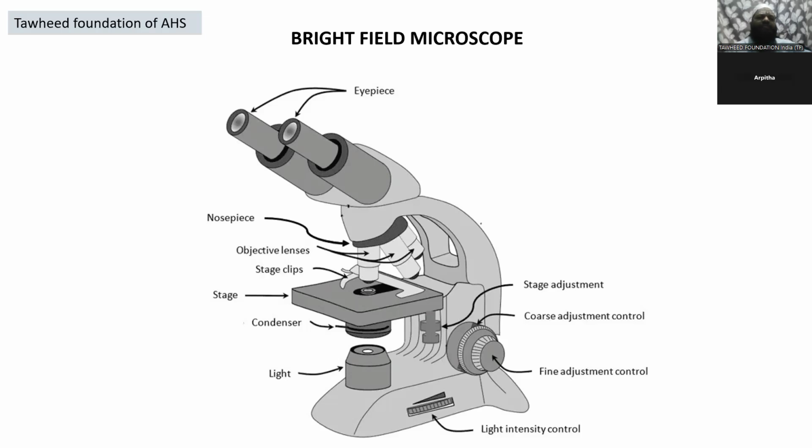The ocular lens is also known as the eyepiece. The image of microscopic objects can be viewed through these lenses. There are four types of magnification in the ocular lens: 5x, 10x, 15x, and 20x. Here, the objective lenses will be 10x, 40x, and oil immersion, that is 100x. The binocular head is the device that uses two eyepieces and has many mirrors and prisms, which make passage of light easier, so the object kept on the stage appears clearly.